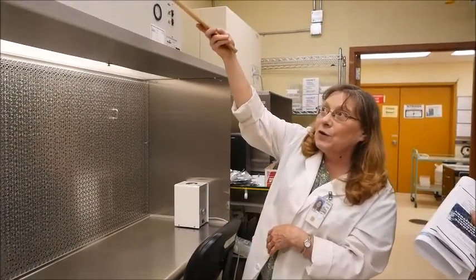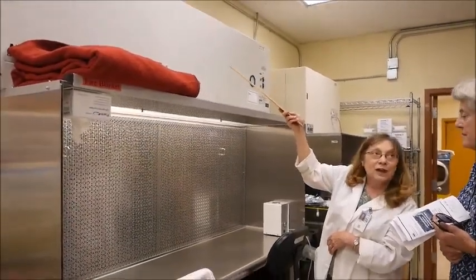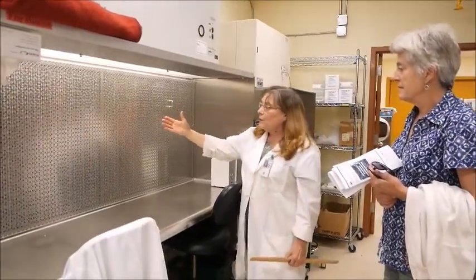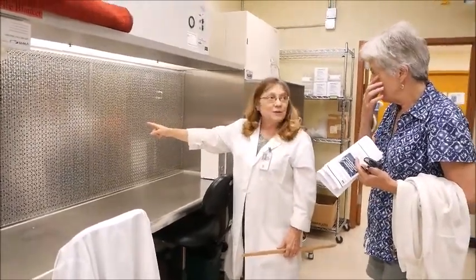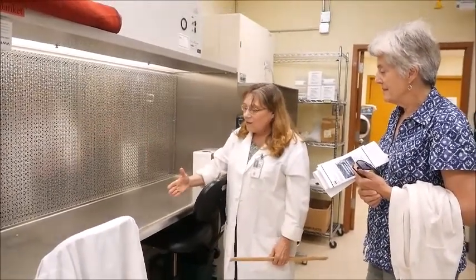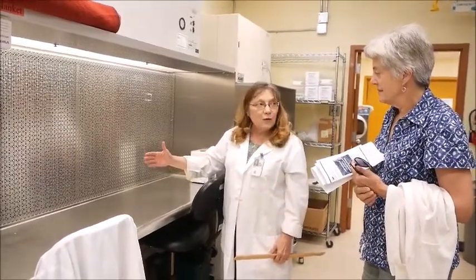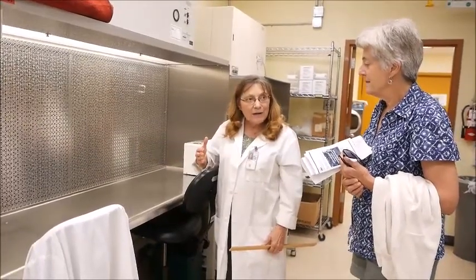Up above there's a coarse filter and a fan, and it draws air in through that coarse filter. Then it blows the air out this way through that HEPA filter, which is the spacey stuff you see back there, and that gives you a sterile workspace because the air blowing over you is sterile.